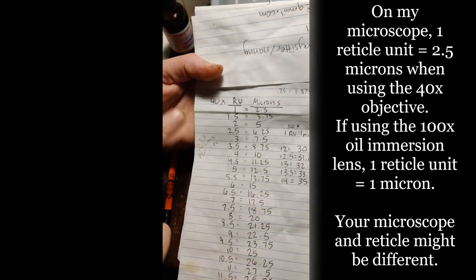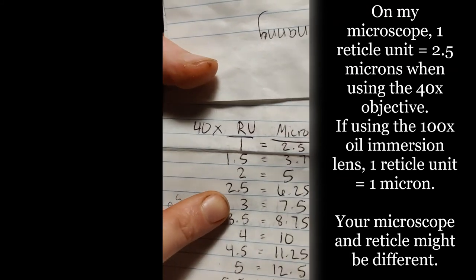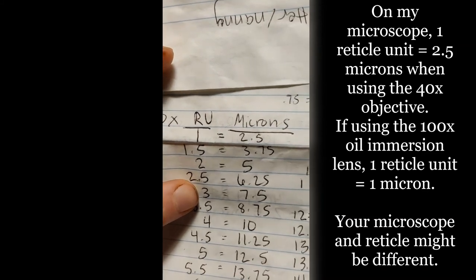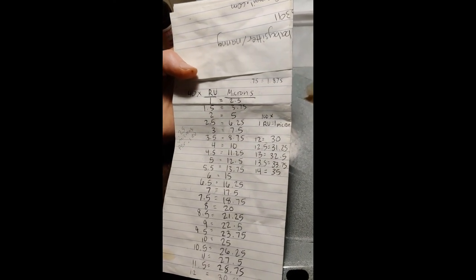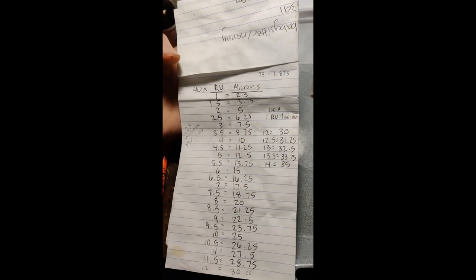So if I find something and the spore is three reticle units long, then it's actually 7.5 units in real life. So that is how you would measure the spores. Hopefully that's helpful to people.